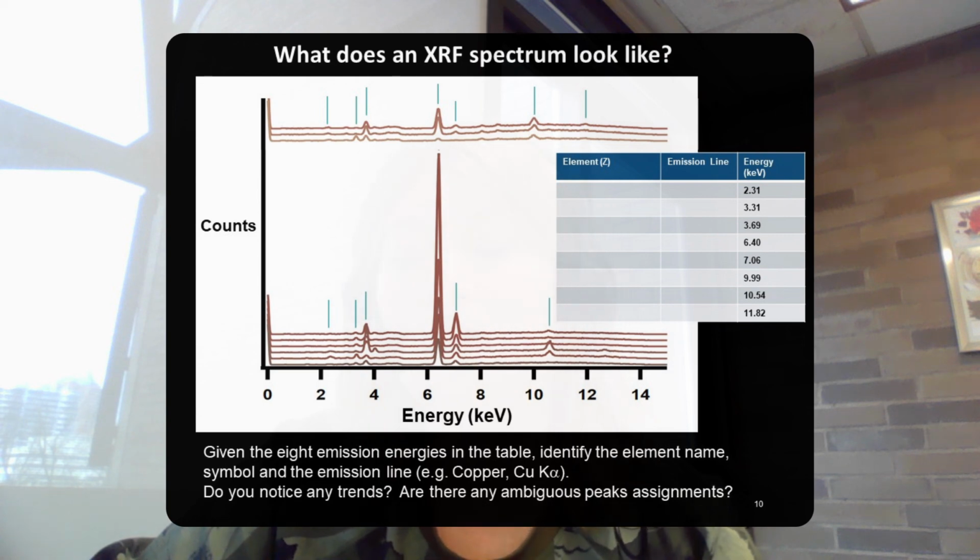As you work, do you notice any trends? Are there any ambiguous assignments? In the next mini lectures, I will elaborate on XRF spectral interpretation. For now, just do your best and try it out.